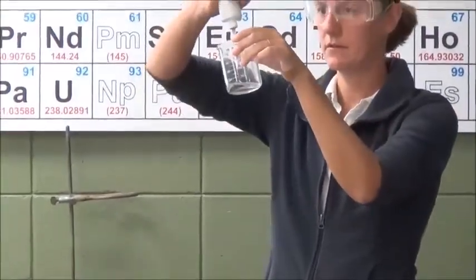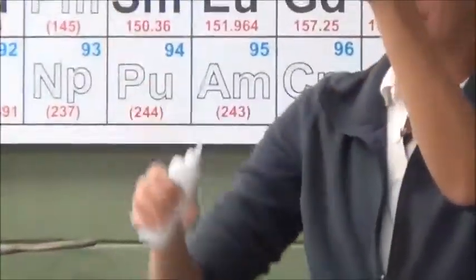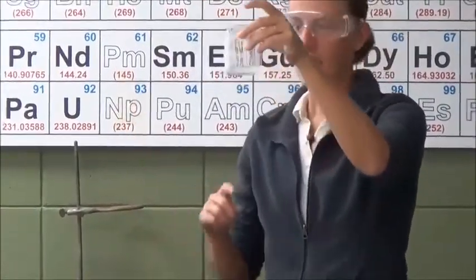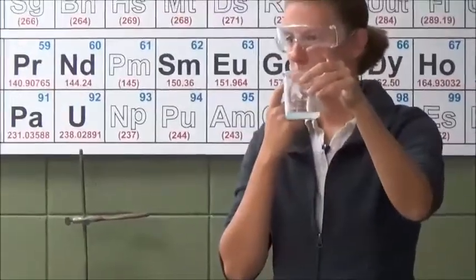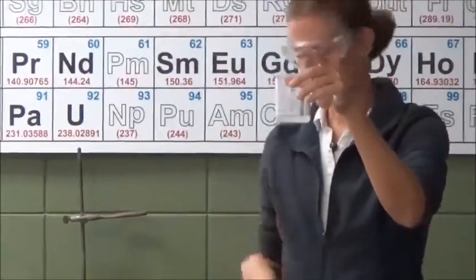What happened to change color? Kind of. What happened there? Murky. It got murky. What is that? Some kind of tiny ball to like color. Look on your list. This is the new one to us. Precipitate. This is a precipitate.